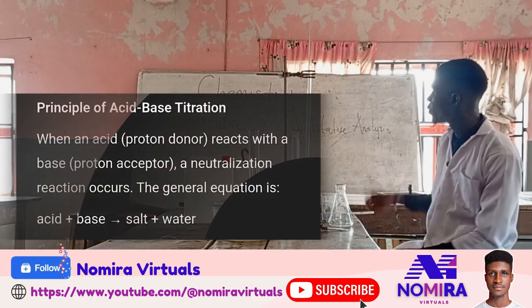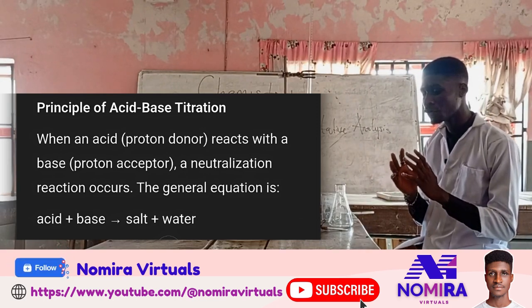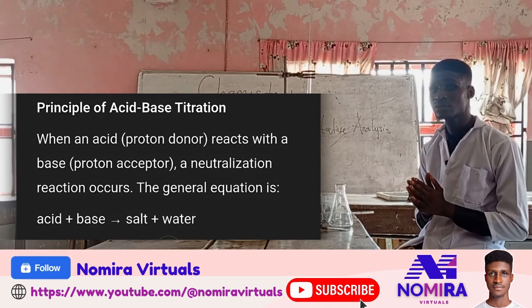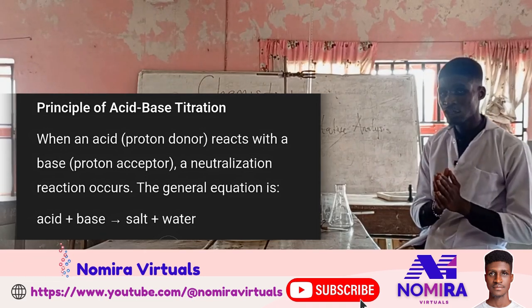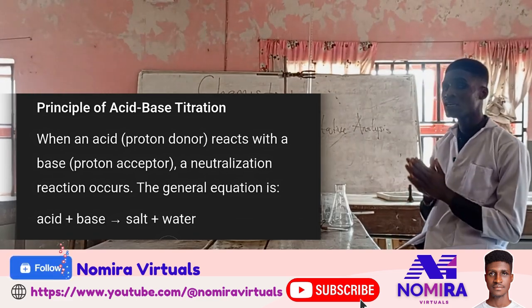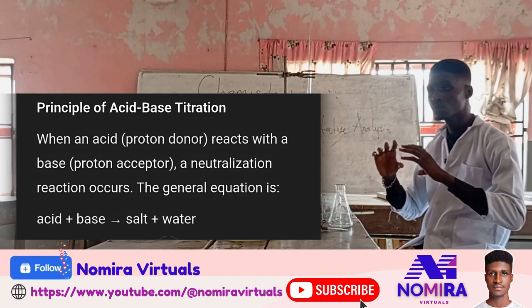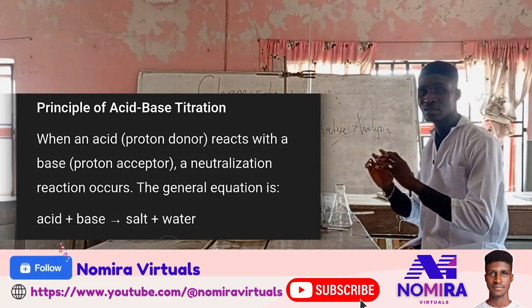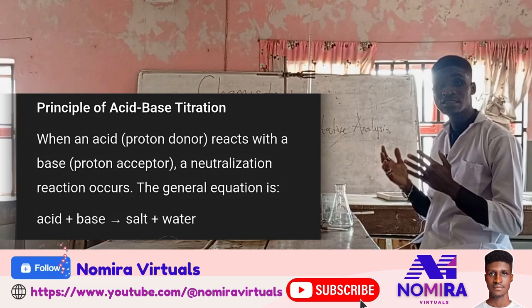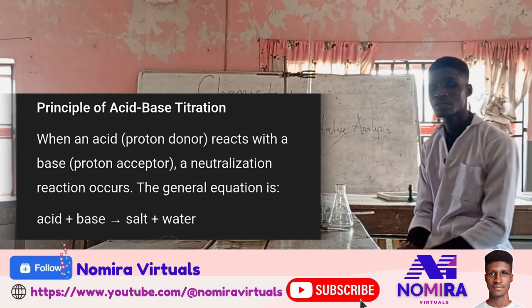To put it in perspective, why we are doing quantitative analysis is for us to actually know the concentration of a particular substance, maybe an acid or a base. And then we can also find out the volume of the acid used when the reaction between acid and base has completed, in which case neutralization has occurred. Neutralization is just the chemical reaction between acid and base that ends up forming salt and water only. Then titration is just the technique or method that we use to achieve neutralization.